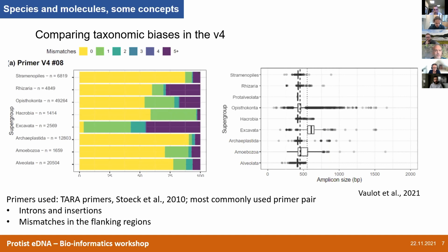Now I come to the problems. The primer pair I give as an example is for V4, and nowadays most people are sequencing V4. This pair of primers amplifies different groups of eukaryotes in a biased way. Most of the excavates are not correctly amplified, and in other groups the proportion really varies. This can be an issue if you're working in environments where you have a lot of these organisms.